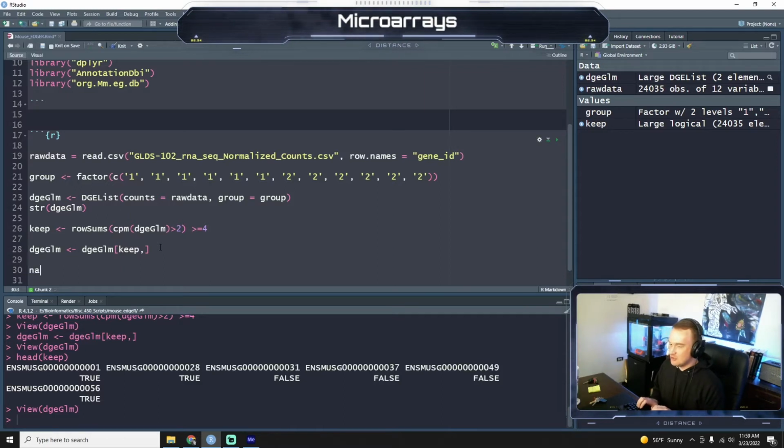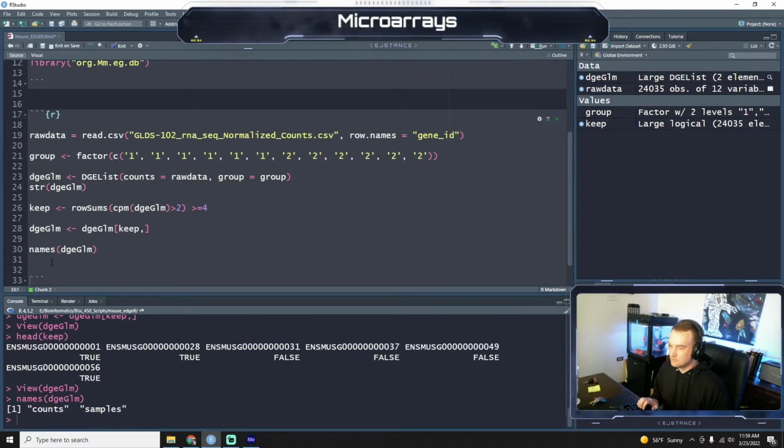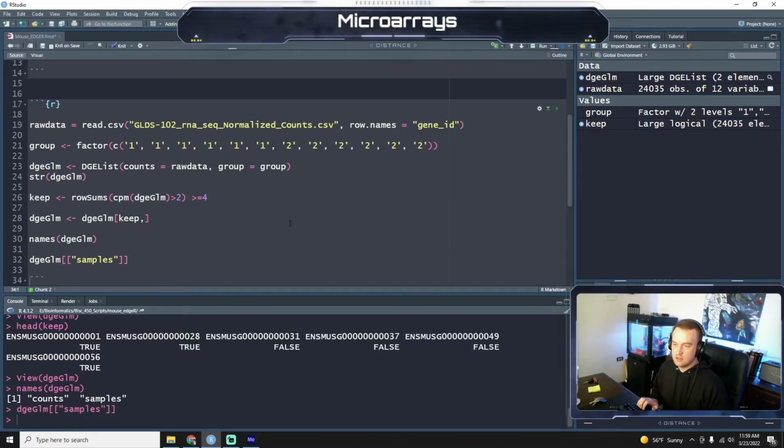Okay, so let's look at the names of DGE GLM. So you see we have counts and samples, which is perfect. So let's run this again.